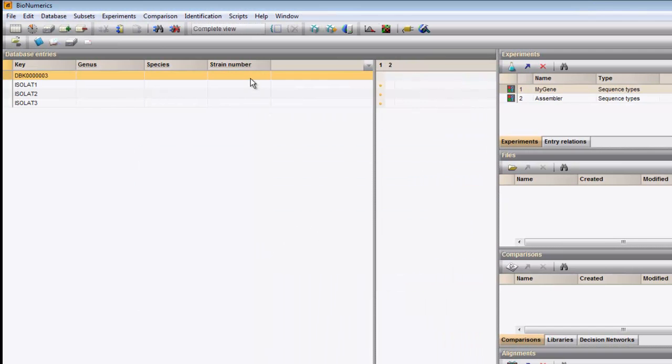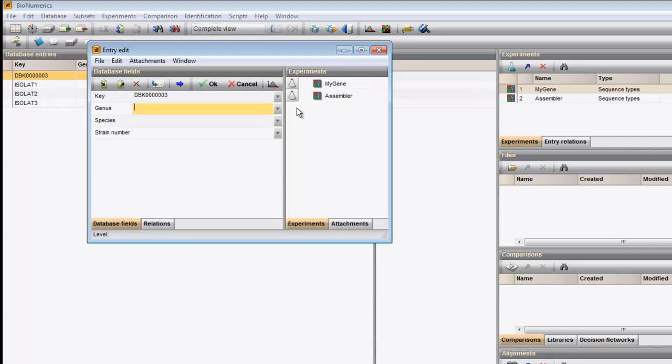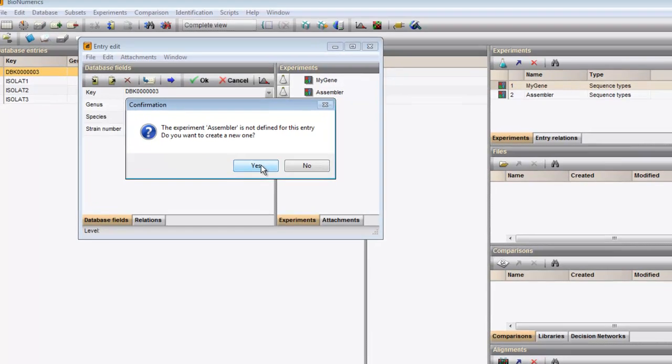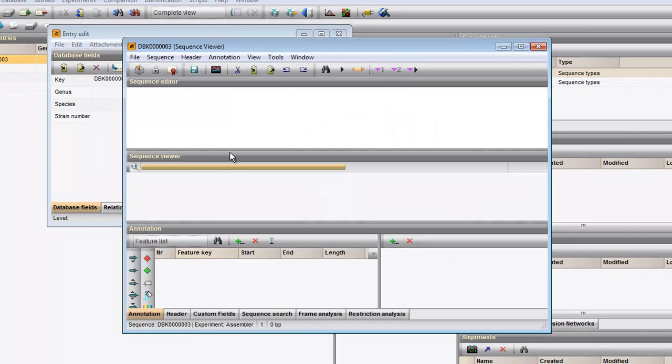Double-click on the newly created entry and in the entry edit window, click on the flask next to the newly created sequence type. The software tells me that this experiment is not yet defined for this entry and asks whether I want to create a new one. I confirm. An empty sequence viewer window opens.